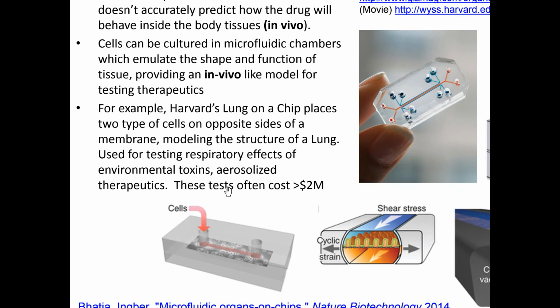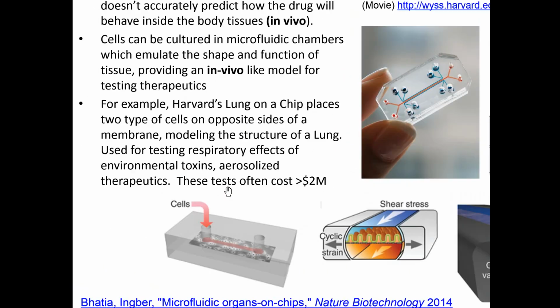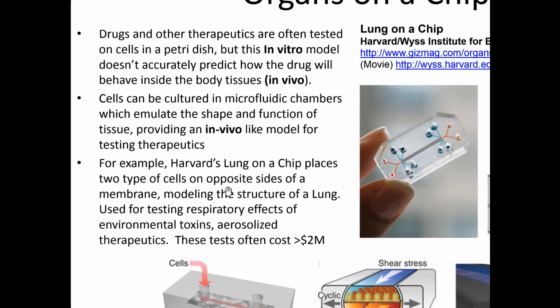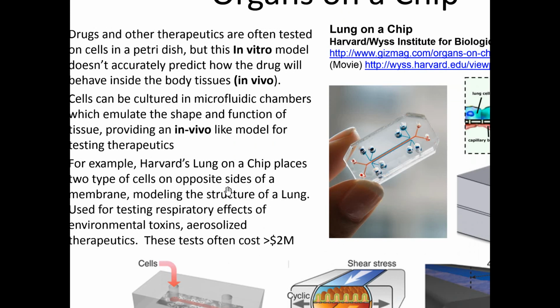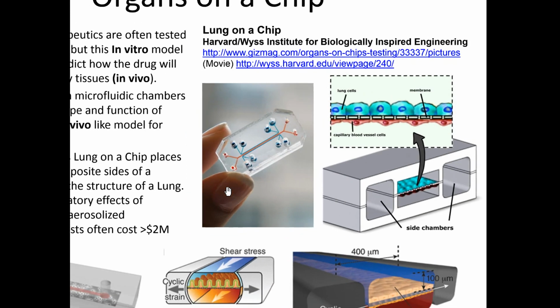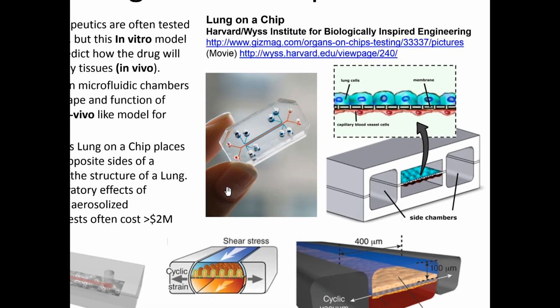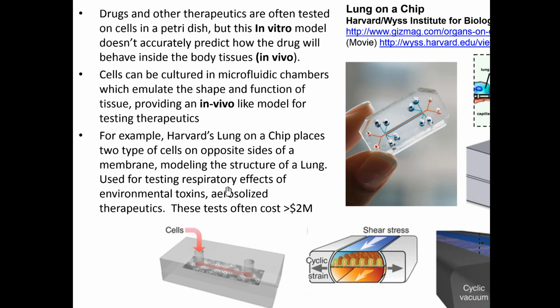This is an example, let's see. I think this company's name was Emulate, if I'm not mistaken. I don't quite remember the name of the company, but Harvard and the Wyss Institute actually commercialized this technology. It's a simple microfluidic device. It looks rather simple, but what it does is emulate the structure of a lung, and they've used that for testing these types of things that I just mentioned, environmental toxins, aerosolized therapeutics.